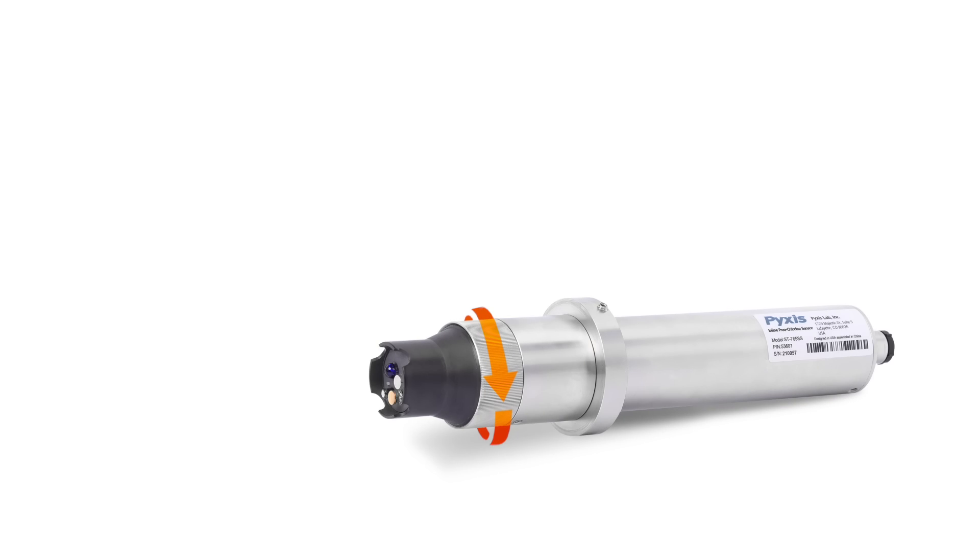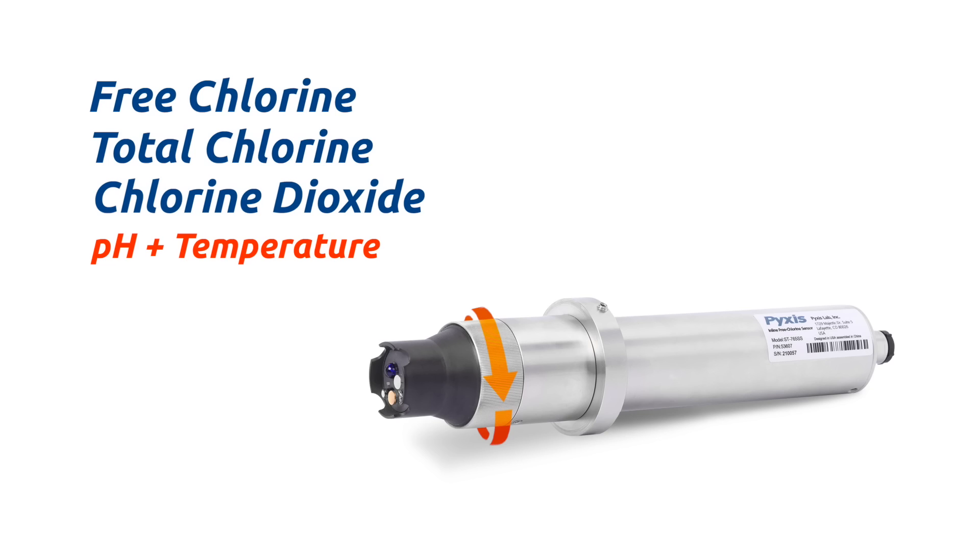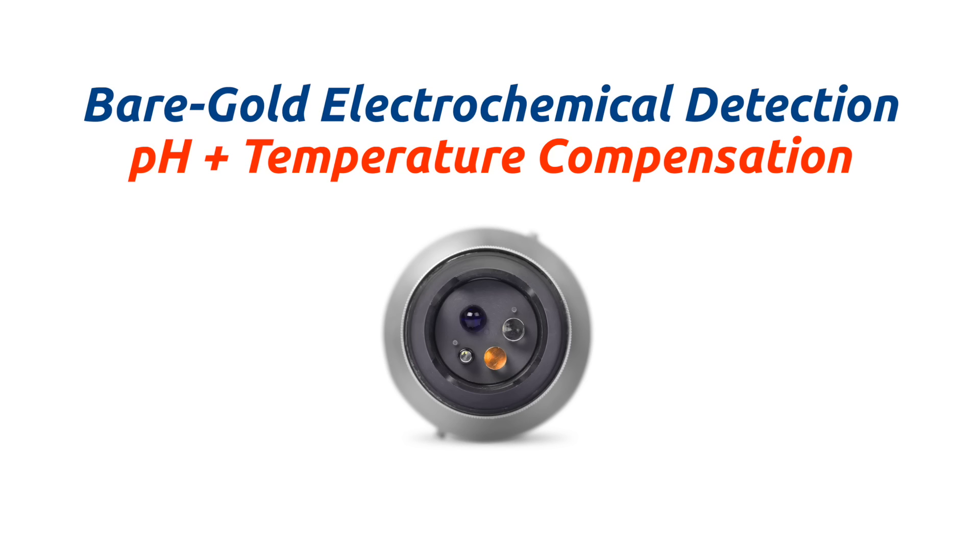The OxyPanel Series features the ST765 Smart Sensor Design. Available in free chlorine, total chlorine, or chlorine dioxide plus pH and temperature, the ST765 sensor design is membrane-free and based on a unique principle incorporating advances in the field of bare-gold electrochemical detection.